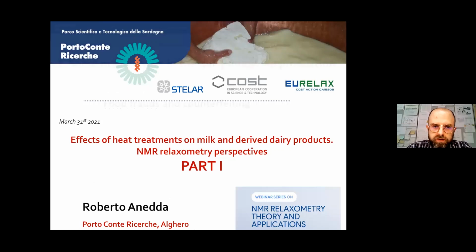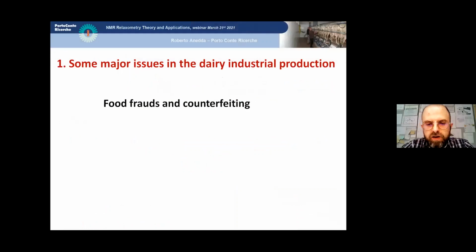So let's go further. First of all, I would like to say that analysis of milk and dairy products has a long history, of course. However, dairy producers are still facing some relevant problems and issues. I'm just going to list some of the most important here. For example, dairy producers are often struggling with frauds and counterfeited productions. These productions pollute the market, especially that of the most requested delicacies, let's say typical and traditional dairy products. Mostly they are cheeses, aged cheeses.